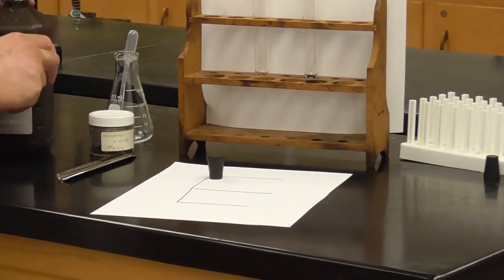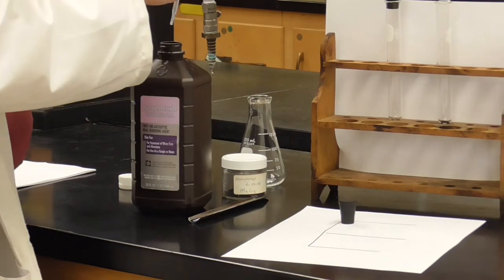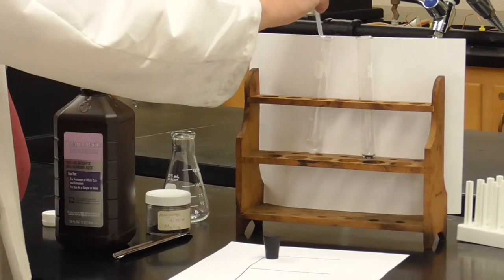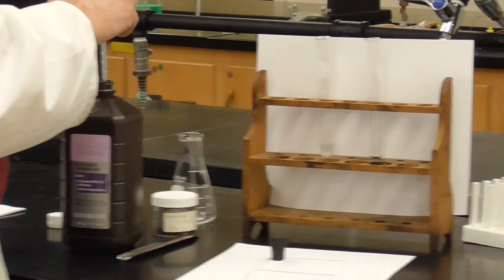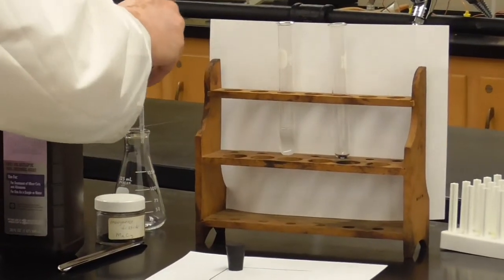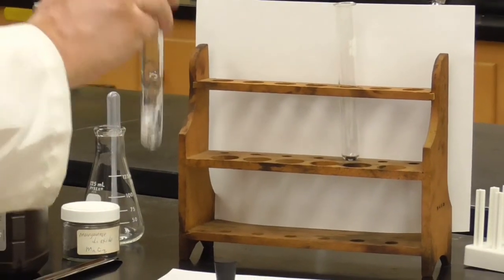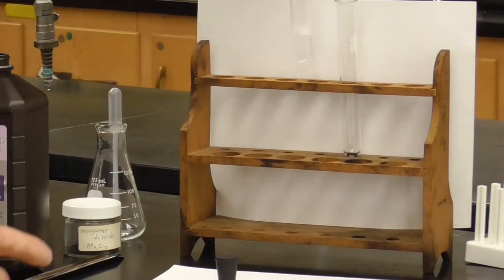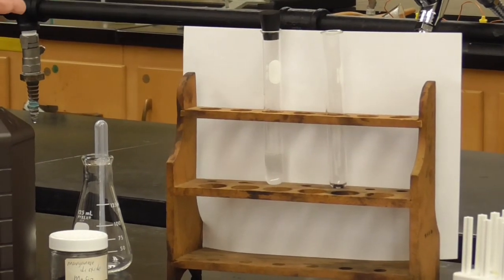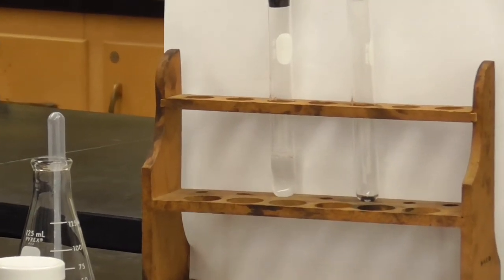And now our hydrogen peroxide. I'm going to put a squirt in the first test tube. Again, we'll just put it in by itself. Two squirts, it's about 2 milliliters. And this is kind of our control. There it is. We can kind of shake it up to see if anything happens there. But there's our normal hydrogen peroxide. It is decomposing. It is giving off oxygen gas, but it's a very slow reaction. In fact, we might be lucky to see a bubble or two happen there.